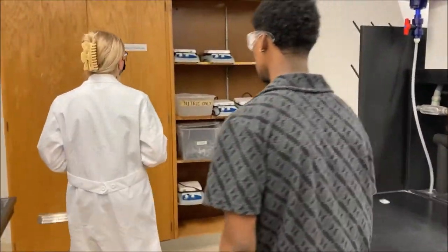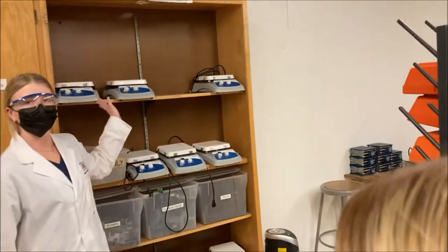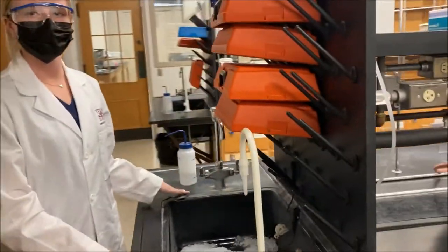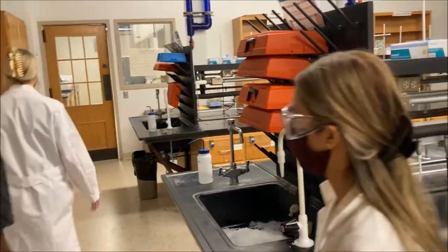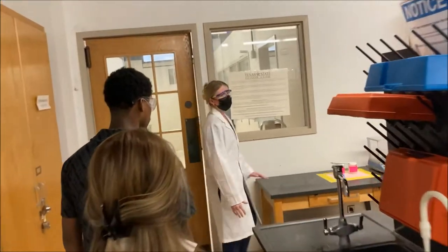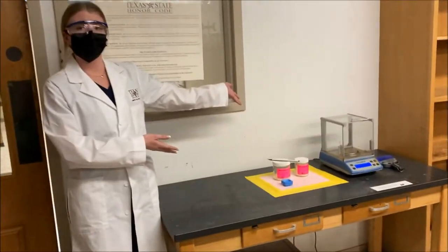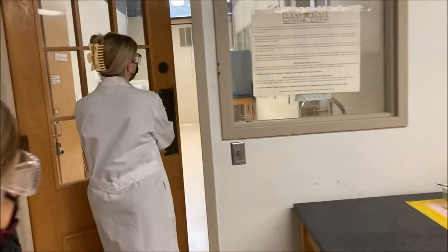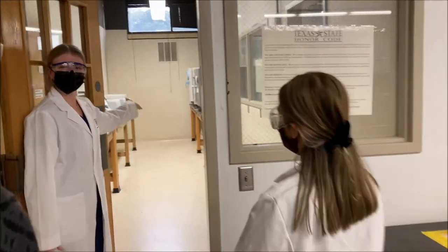Coming this way, you'll see extra storage and a sink for washing up. Along this side of the lab, there's another scale. And right through this door, you have your ovens.